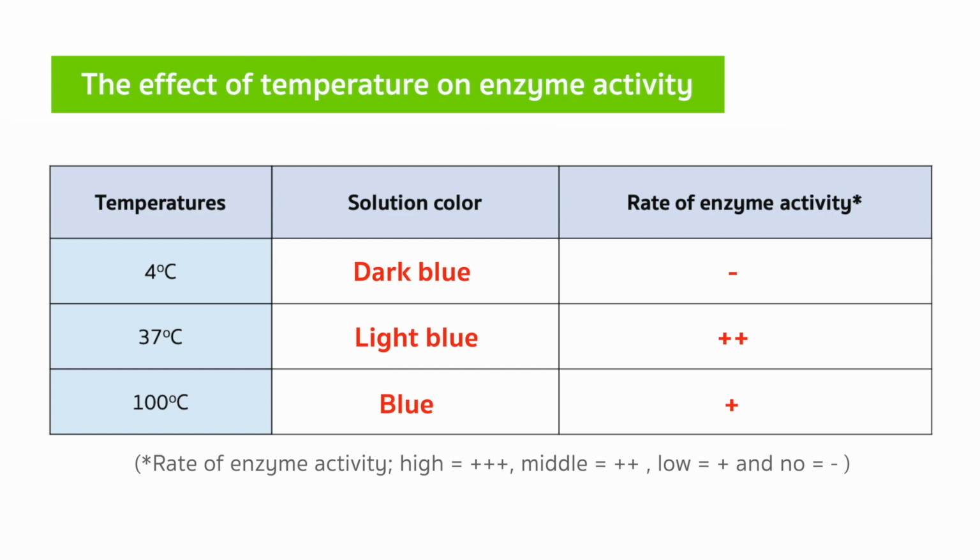Starch contains alpha amylose, a helical polymer, and amylopectin. The structure of the helical amylose is key to the iodine-starch reaction. Starch forms a dark blue color complex with iodine. Simple oligosaccharides and monosaccharides don't form this complex. Therefore, color intensity indicates the enzyme activity of amylase and the concentration of starch in the sample.